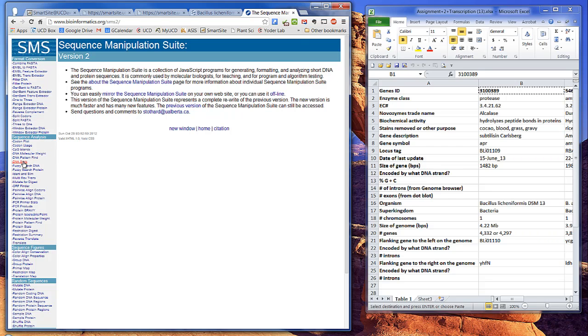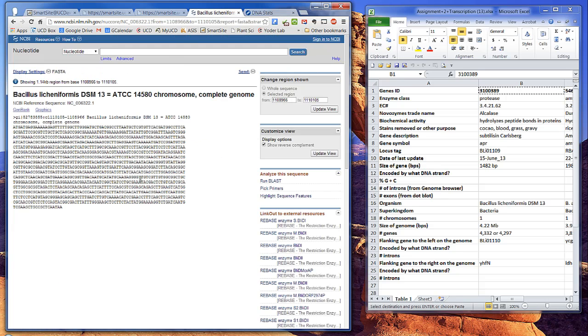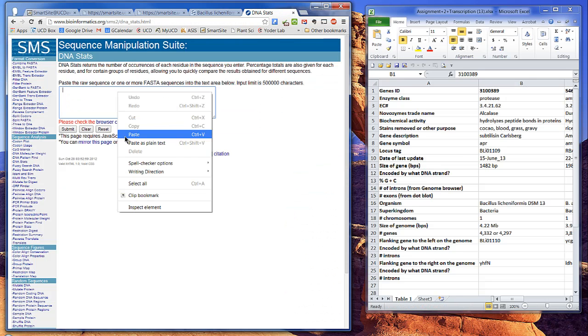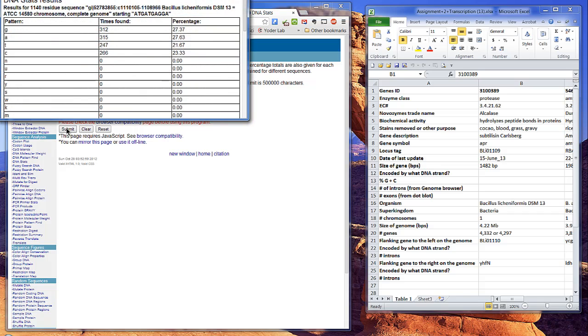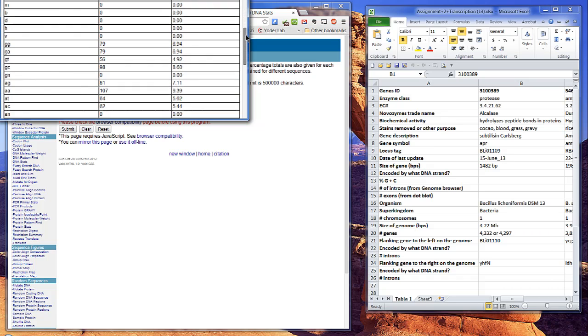Now go back to the FASTA file, copy this, and paste it in the window. This program tells you the percentage of each nucleotide in the DNA. Because GC bonds are tighter than AT bonds, molecules with higher GC content have higher denaturation temperatures.